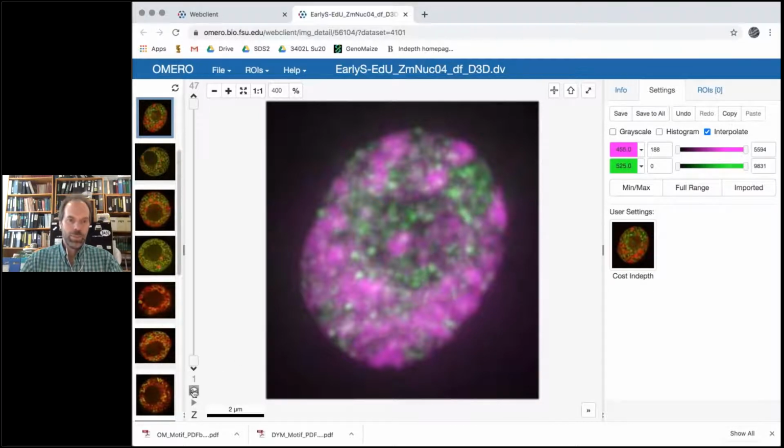So let's say you have an image and you'd like to save it, put it in a notebook, put it in a report. What you can do is two or three different ways to do that. One is you can just take a screenshot of what you're looking at, the typical whatever you have on your computer that captures part of the screen. Like this, I just draw a box over it, and I just saved a picture of that.